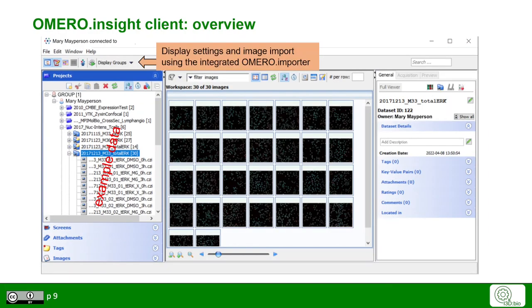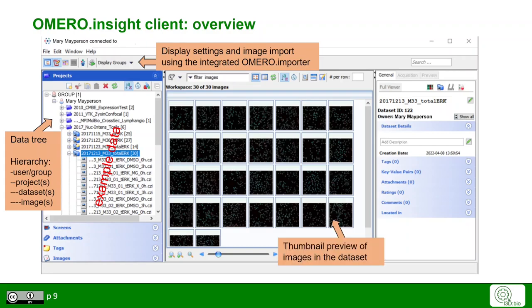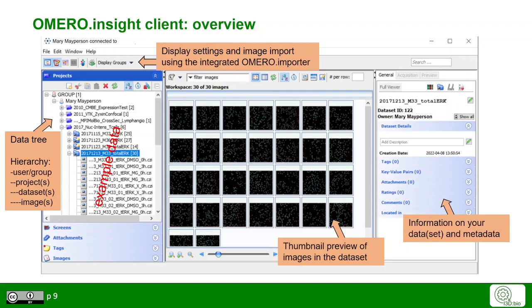With the upper hand icon panel, you can change the display settings and import images using the integrated Omero importer. On the left hand side, you see your data tree hierarchy that has a flat hierarchy of users in groups, projects, datasets and images in datasets. In the middle, you see thumbnail previews of your images in the particular datasets. On the right hand side, you see additional information on your dataset and the metadata.